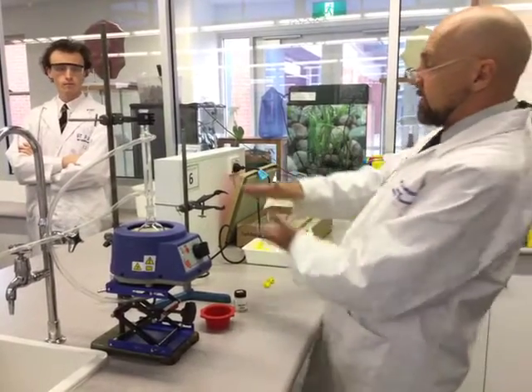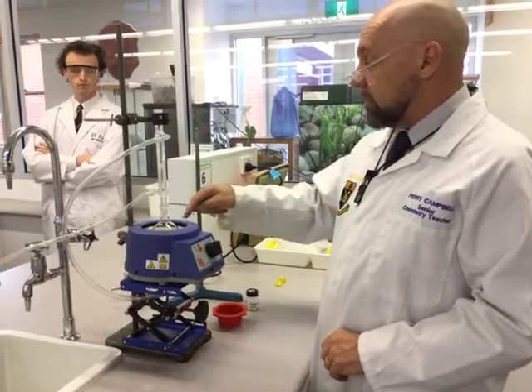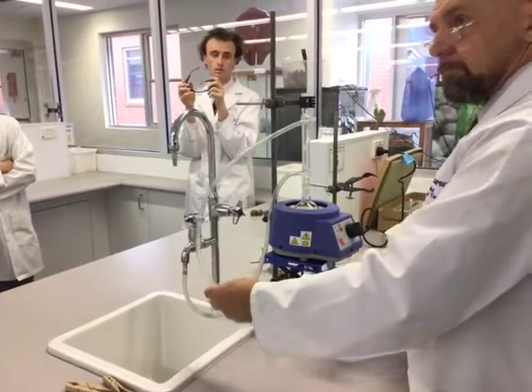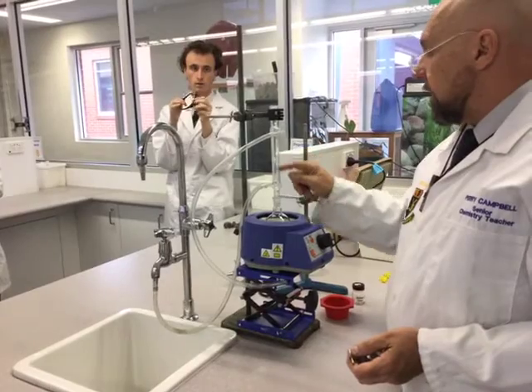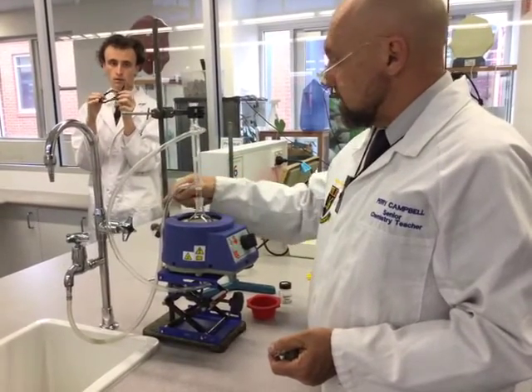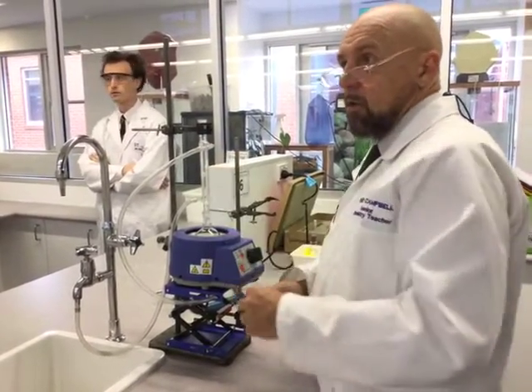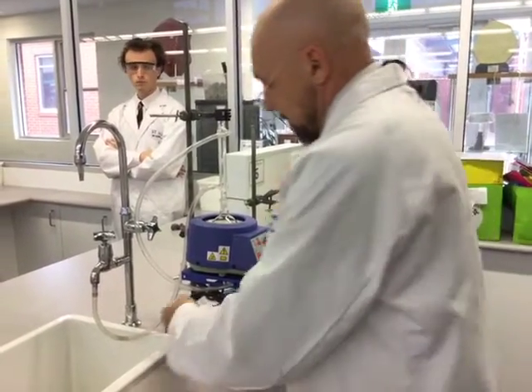This is a lab jack, and I'm going to set that up for distillation in another video once we get the reflux done. The water will go in through the bottom — the reason being gravity. If you had the water coming in from the top, it would just run straight back down, so the majority of the condenser wouldn't be surrounded by water. If you fill it from the bottom, it fills up entirely from bottom to top, so the vapor is in contact with water all the time. If we didn't have that, we'd lose the product and anything else to the atmosphere.